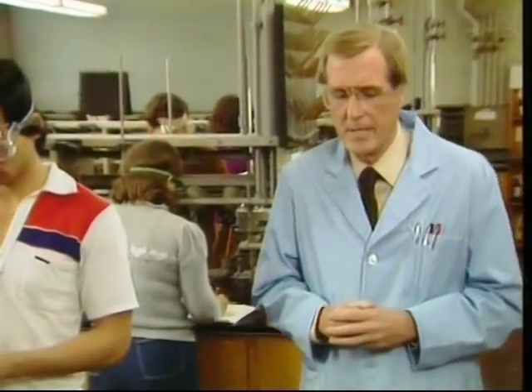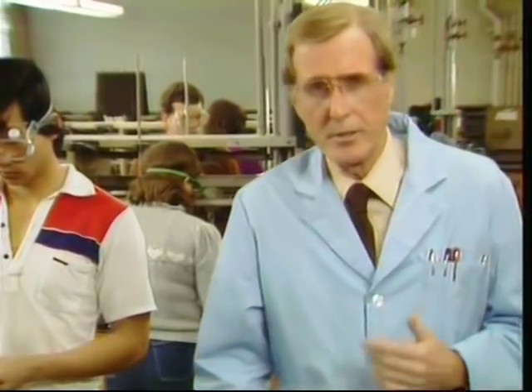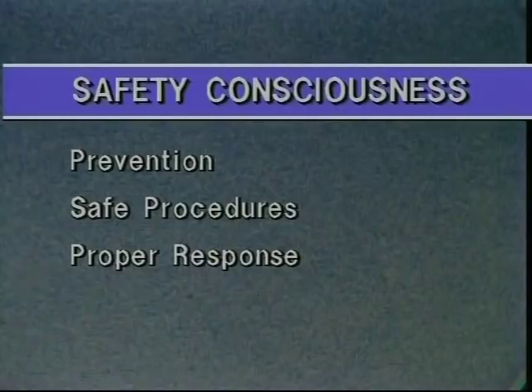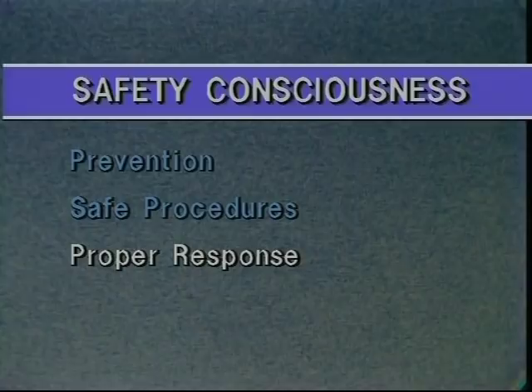However, it's a sobering fact that accidents still occur. Maybe right here in your lab now, during this school term, an accident might happen to you or your neighbor. The risk will be less if you are safety conscious, but the risk is still there. So what do you do when an accident happens? What are the proper responses?